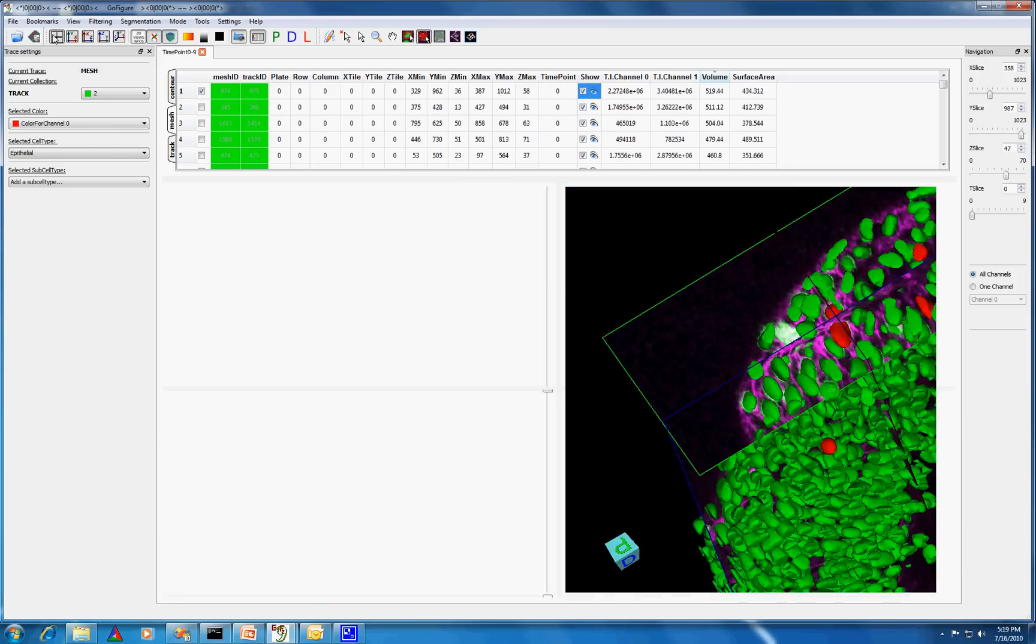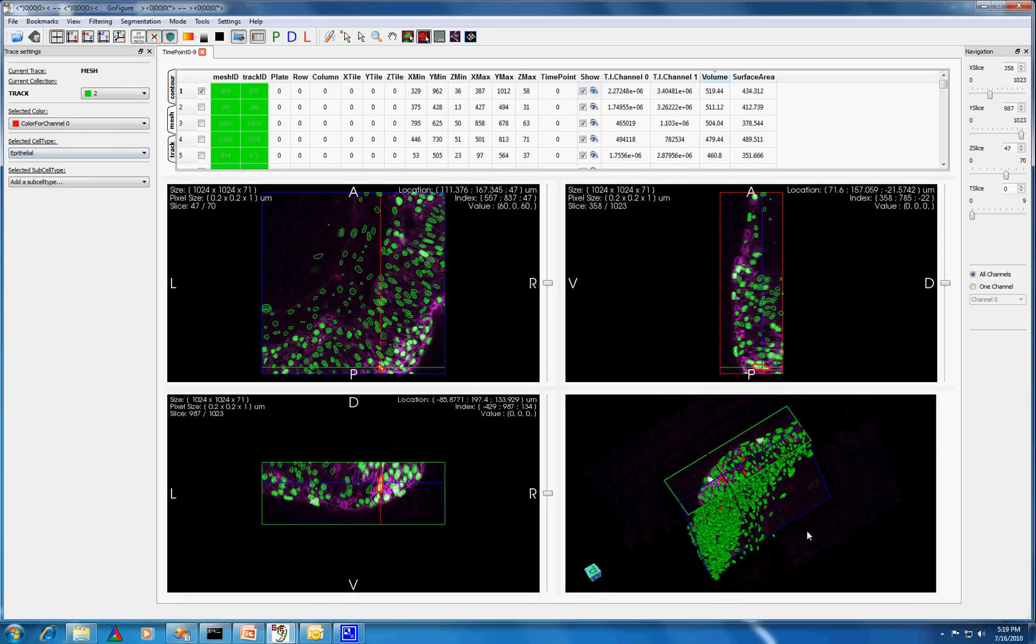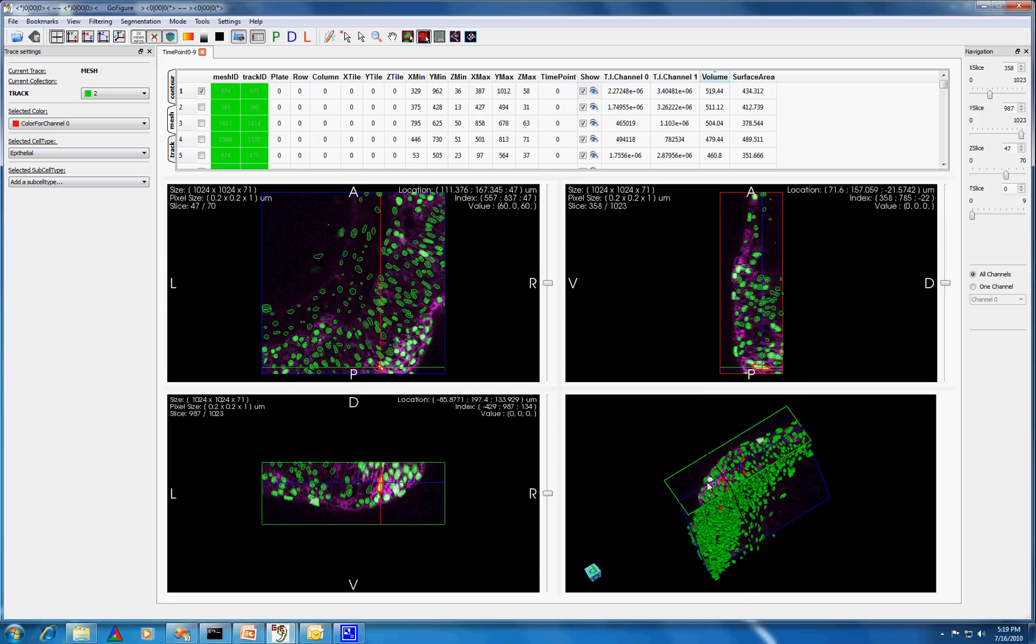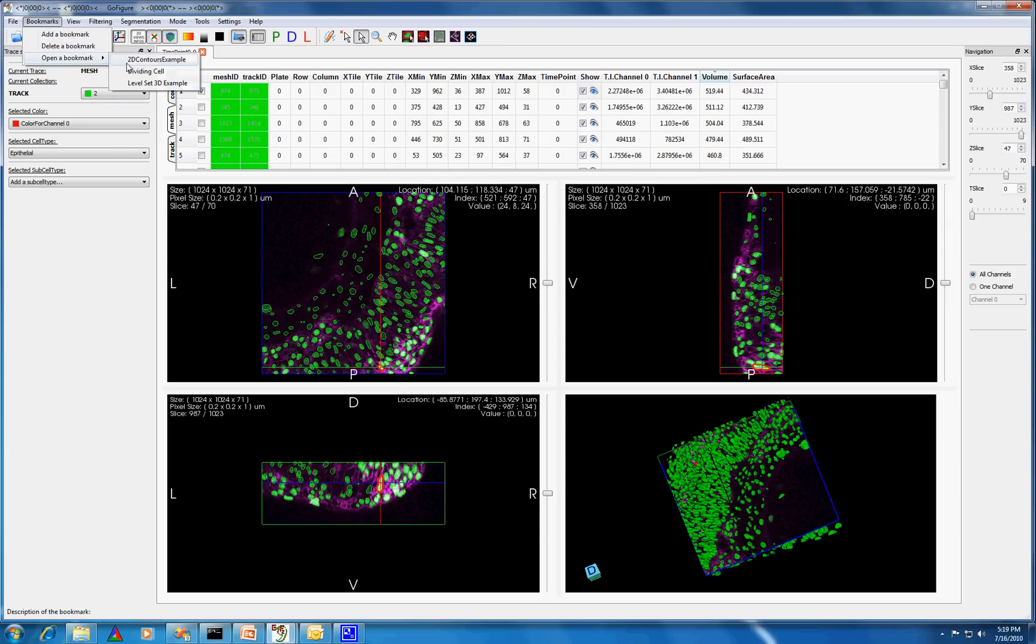Apart from analyzing segmentation results, you can also track cells using this software. Let's say that I'm interested in tracking cells that are dividing. I have already looked through this dataset and found one such cell, so I have bookmarked it. Let's take a look at the cell I've chosen.